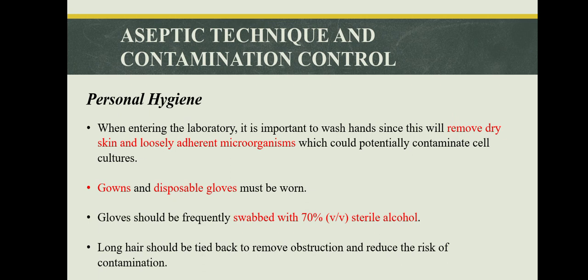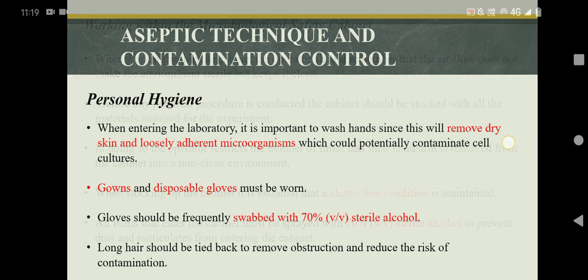Aseptic technique and contamination control by personal hygiene. When entering the laboratory, it is important to wash hands since this will remove dry skin and loosely adherent microorganisms which could potentially contaminate cell cultures. Gowns and disposable gloves must be worn. Gloves should be frequently swabbed with 70% V/V sterile alcohol. Long hair should be tied back to remove obstruction and reduce the risk of contamination.